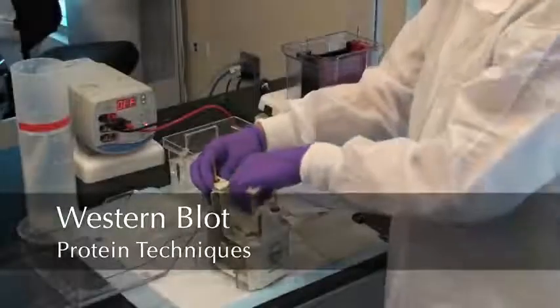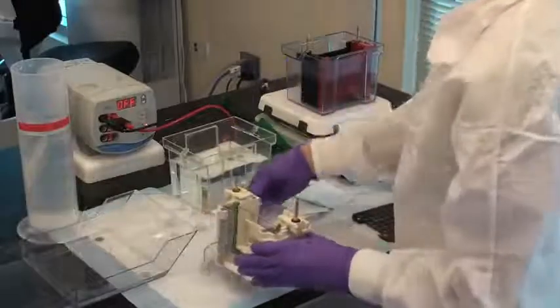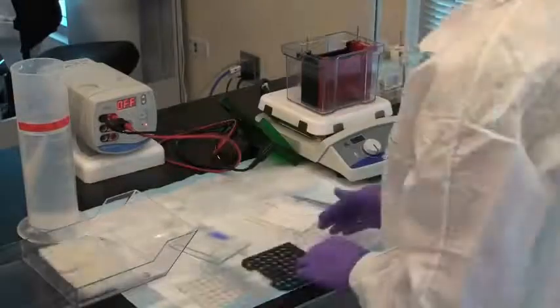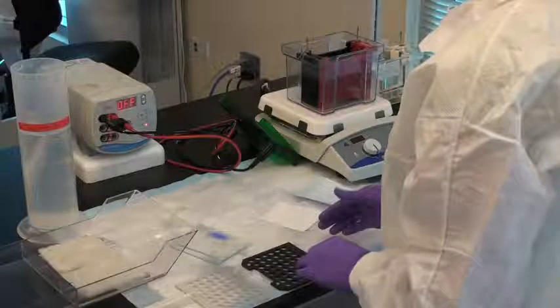Western blotting. When your gel has finished running, you should see that the dye front has moved to the bottom of your gel. Remove the gel from the electrophoresis tank and set up your transfer sandwich. Cut a piece of nitrocellulose membrane or polyvinylidene fluoride (PVDF) membrane to gel size. If you use PVDF, be sure to charge it in 100% methanol.